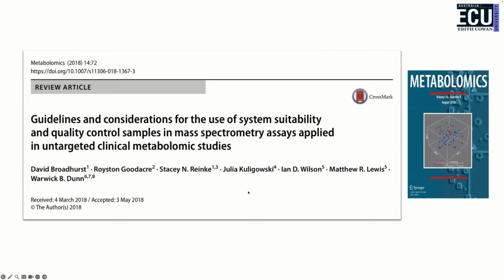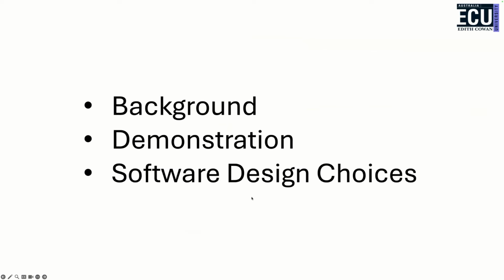Now, this is very much a companion piece to this paper. So if anybody is watching this on YouTube, now would be a good time to pause and go and read this paper, because most of the introduction or the theory side of things is explained in far more detail than I can possibly do in the next 10 or 15 minutes. So let's go. I'm going to talk about some background with a historical flavor, so you can get a feeling of the timeline, then a demonstration of the software itself, and then, if I get time, some ideas about how I went about designing the software and some of the choices that I made.